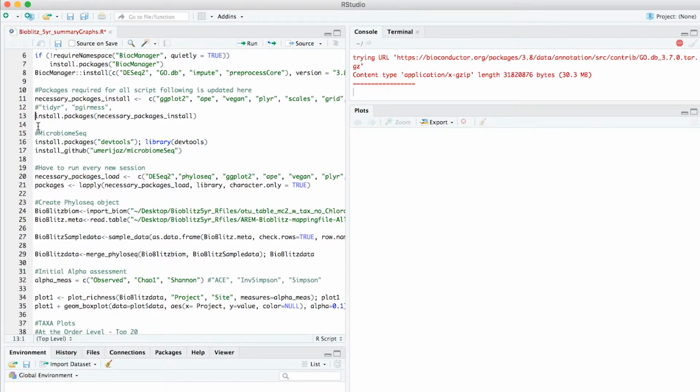That way, when it comes to installing this many packages, I can do it in one step. I can have on line 13 install.packages and then the name of that list that I created as a variable. So you see, again, in line 11, the combined list of all the packages I want, naming it that variable, where then in line 13, I call upon that variable to install them all at once. You can see the progress of the download based on the red bar as it extends. And so we're still waiting for 2 out of the 4 previous ones that we're installing to go through.